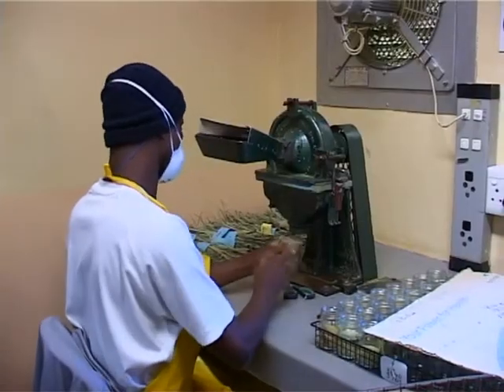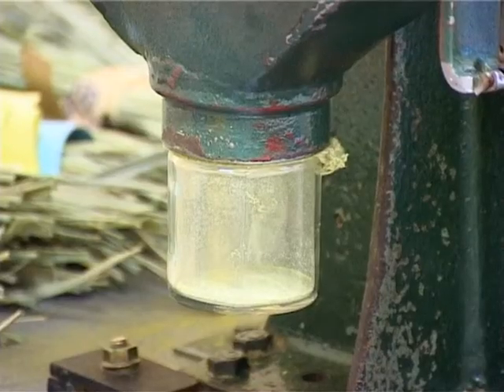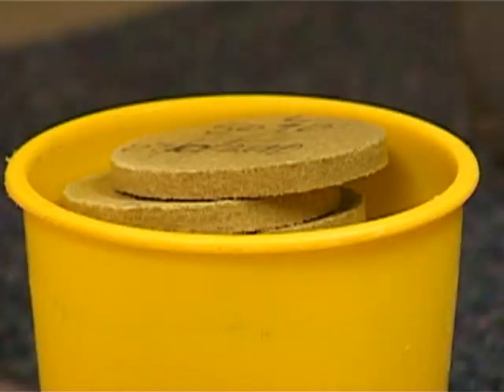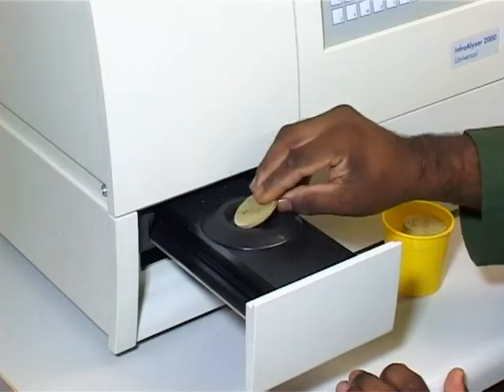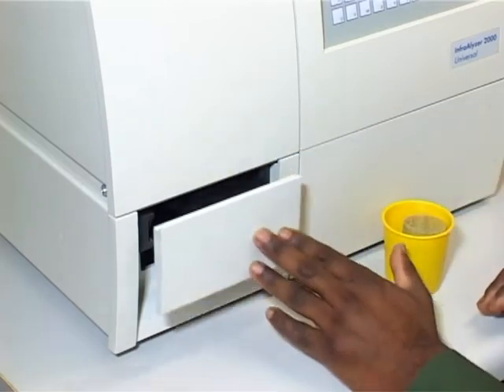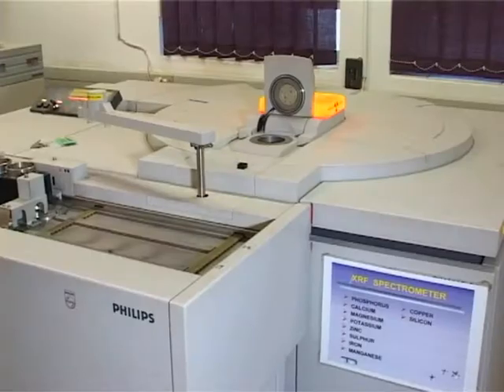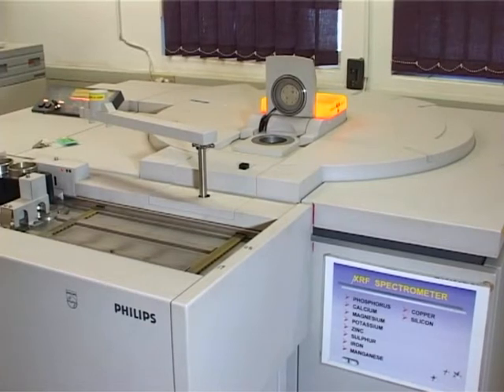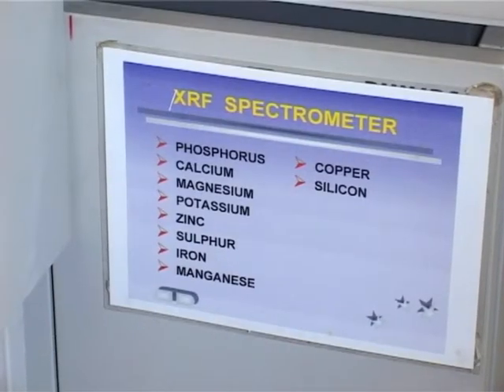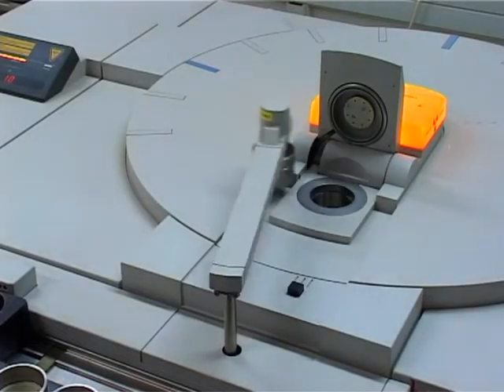Leaf samples are ground and processed further. Cane leaf samples are pressed into discs for analysis. Leaf nitrogen is determined using the NIR instrument. The XRF here is used for determining all the other routine elements, and it is calibrated specifically for cane leaf.